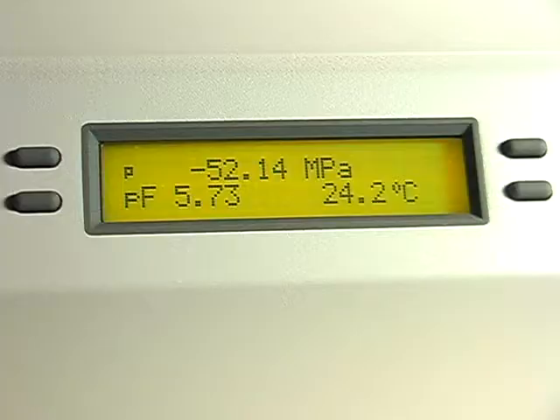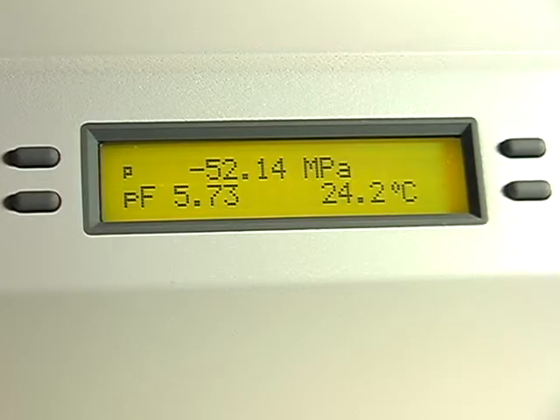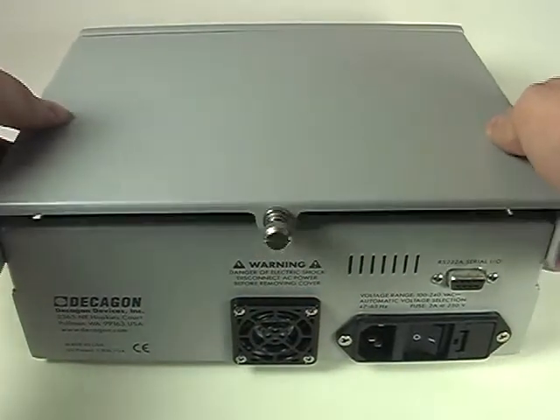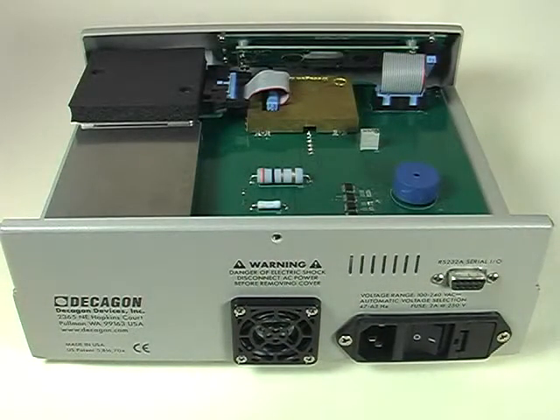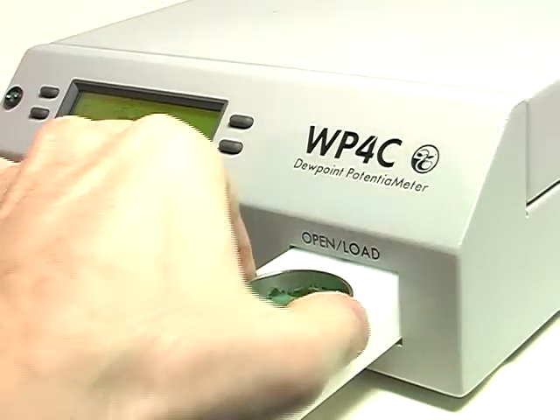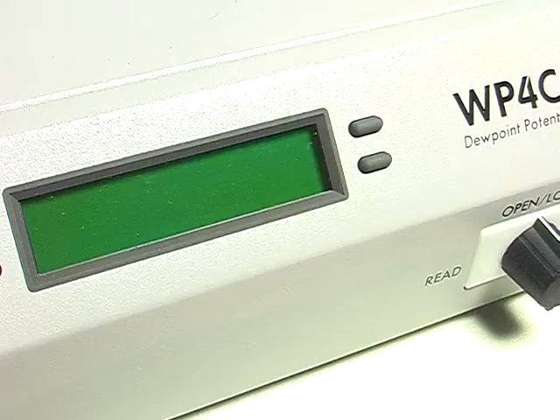Readings take between 5 and 10 minutes. The WP4C has a new hydrophobic coating inside the sample chamber. Since the chamber itself does not absorb and desorb water, the sample comes to equilibrium faster than before, especially with plant tissue and other wet samples.